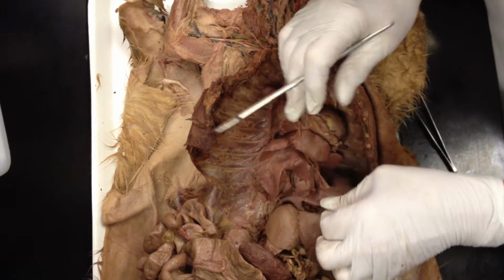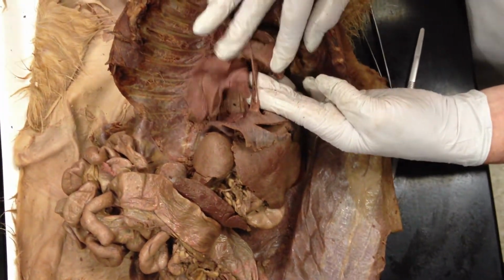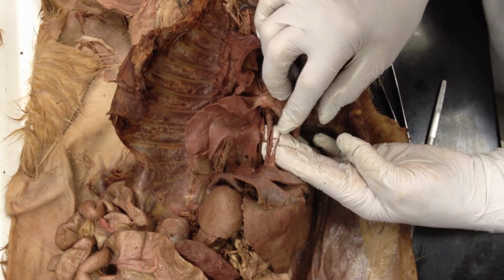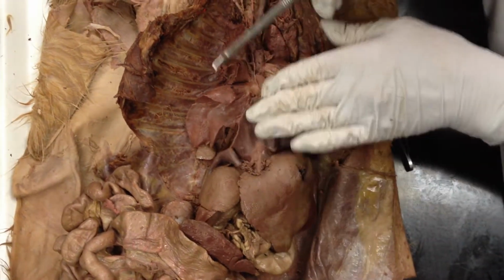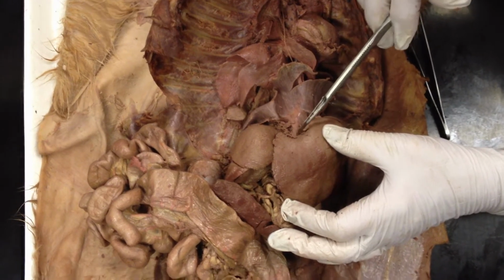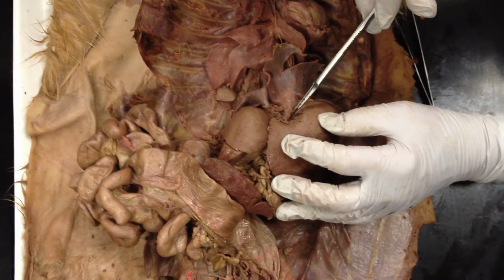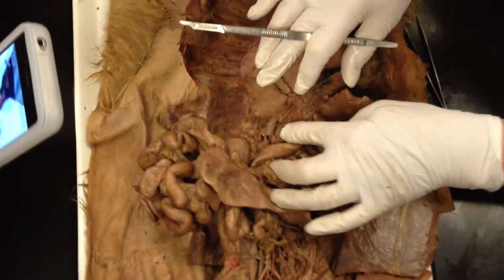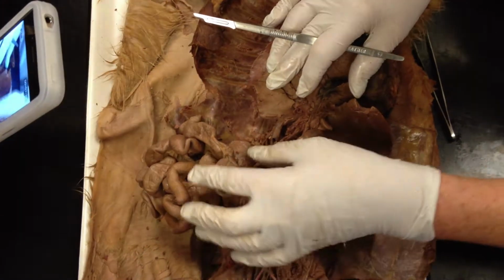Okay, now if I go inferior to the diaphragm or inferior to the heart, I'm actually going to find the inferior vena cava. It's not very blue, only because I opened it up and it really didn't have much color in it. So now, once I perforate the diaphragm, I still have inferior vena cava right here, but right here, I've taken a chunk off the top of the liver, or the superior surface of the liver, so that would be the hepatic vein. If I'm looking for hepatic portal, it is going to be right in this region right here. So you just have to look for something that's slightly blue. We didn't get much blue down here.